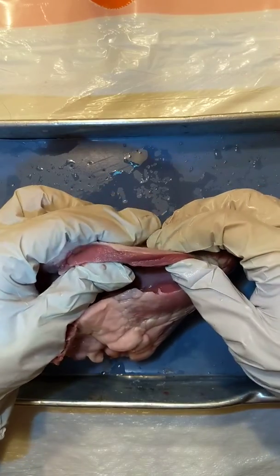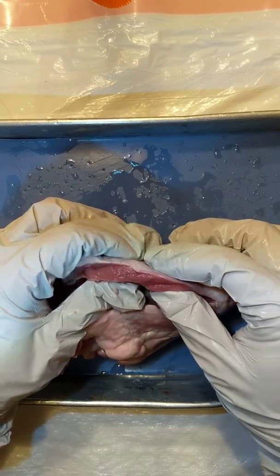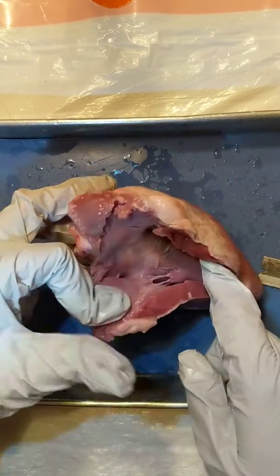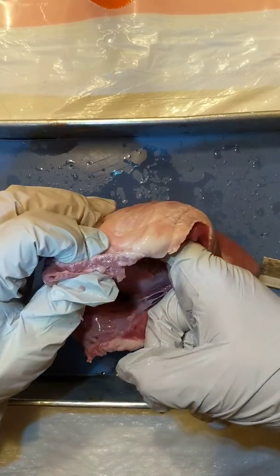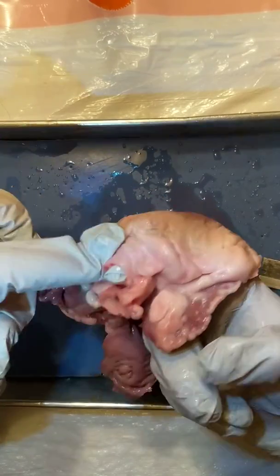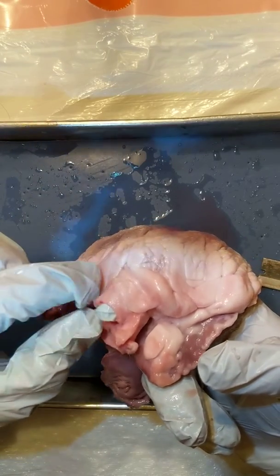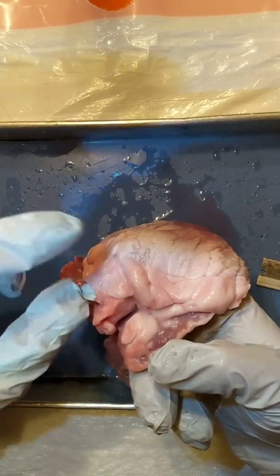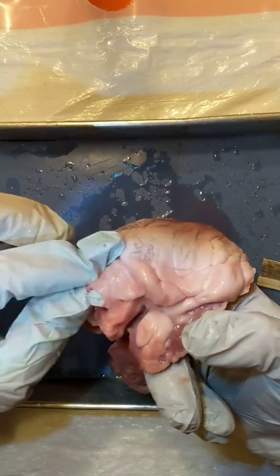This is the right side of the heart — notice how thick it is, about a little less than a centimeter. When blood goes into the right ventricle through the tricuspid valve, it goes up through here, called the pulmonary trunk, because it's heading to the lungs. I put my finger here to show where it comes out — that's your pulmonary artery. There's actually more than one pulmonary artery because you have two lungs, but the branches are cut off so we don't get to see them.